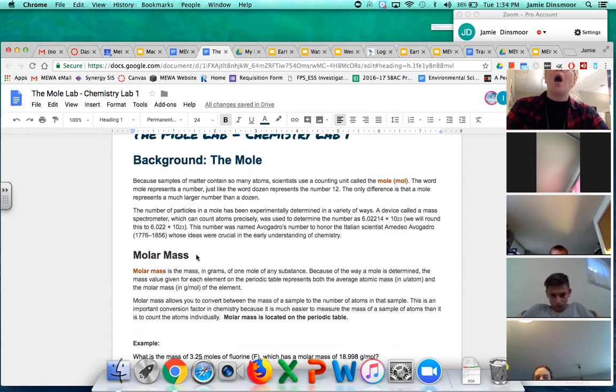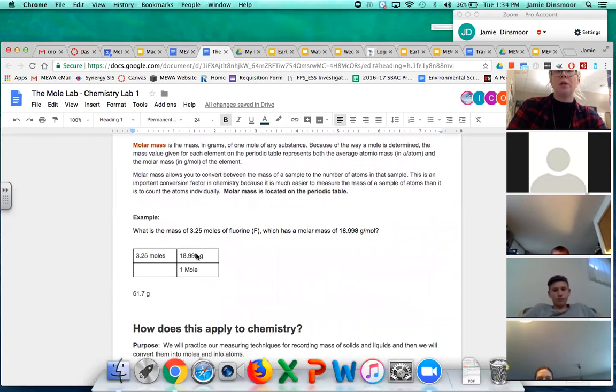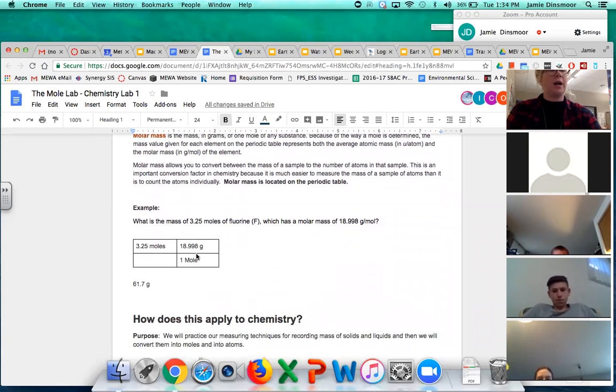There it is. We're going to talk about molar mass again, which is something that we discussed in the last virtual session. We did not go over it more than once though, so we're going to talk about how to find molar mass, and then I actually have some fancy chemicals. They're really not that fancy. I have calcium chloride, which is essentially like road salt to help melt snow, and glucose, which here is in its dextrose form, but it's the same chemical formula. So we're going to be looking at these two solids and also water, which is the easiest thing to use.